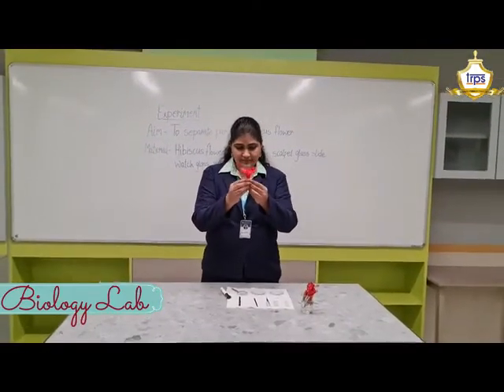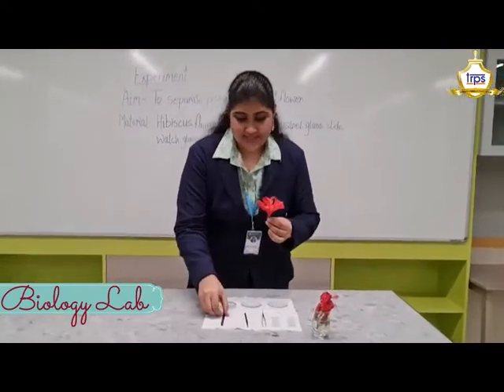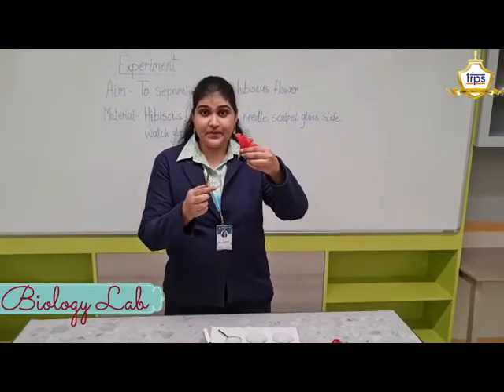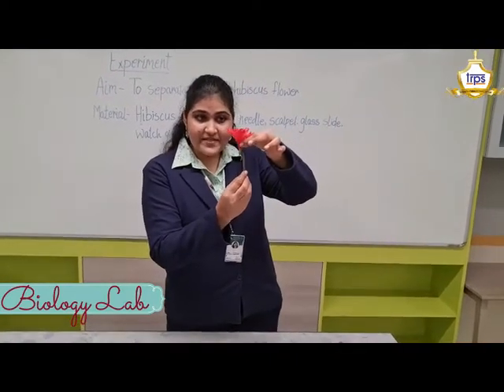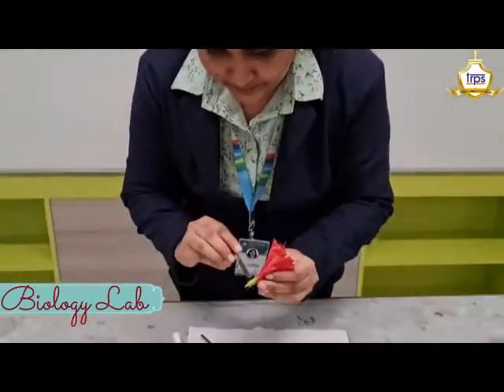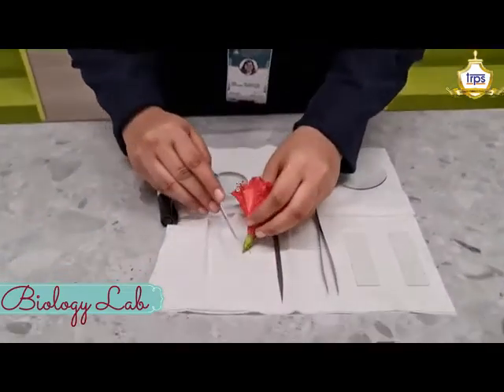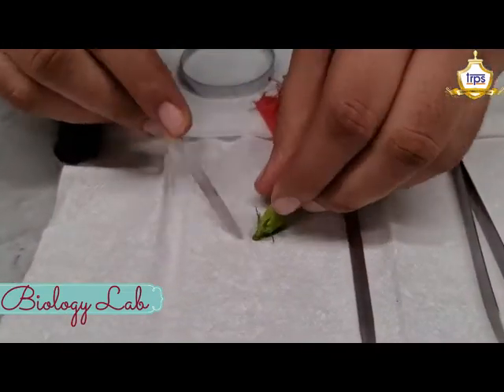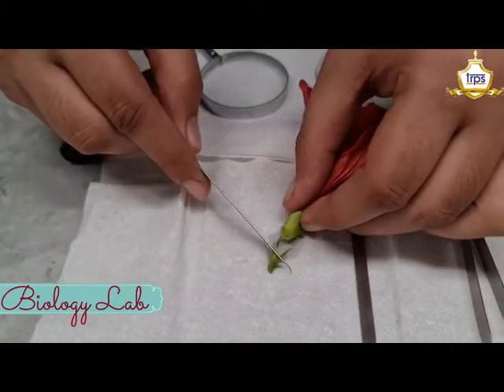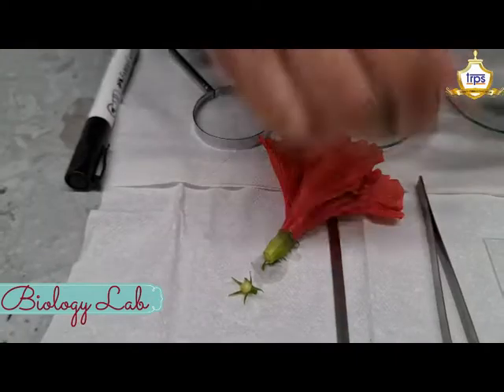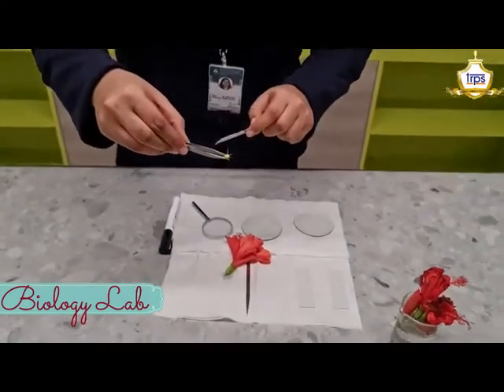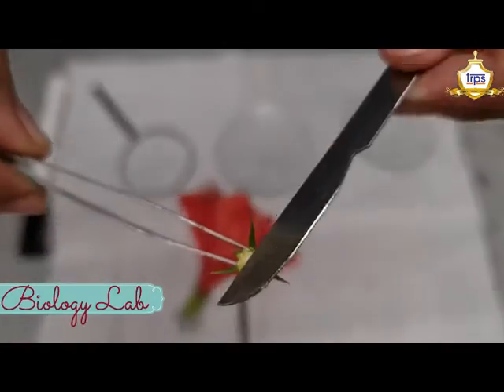This is a hibiscus flower. I am going to take this scalpel and separate the sepals. As we can see, the small leaves surrounding the outer area — these are called the sepals. This hibiscus flower has five sepals in it.